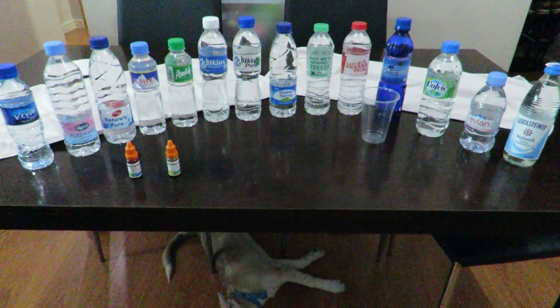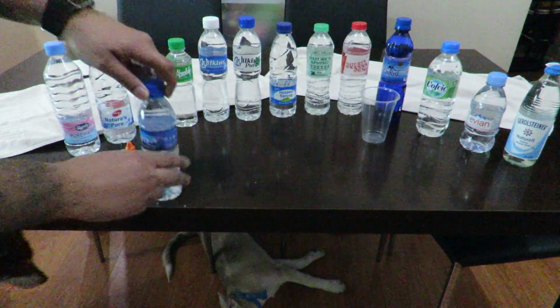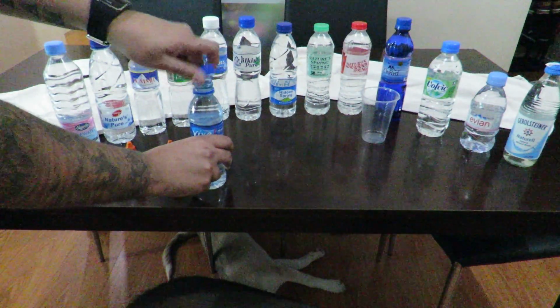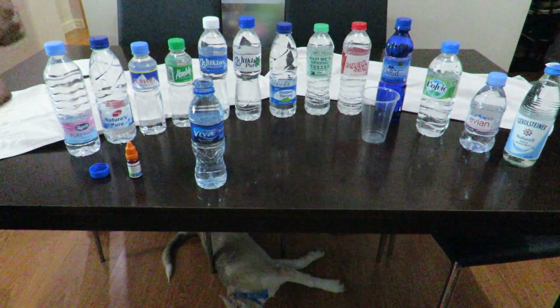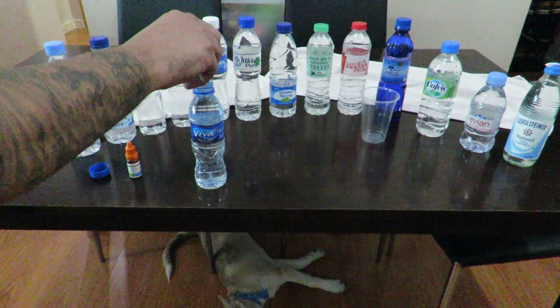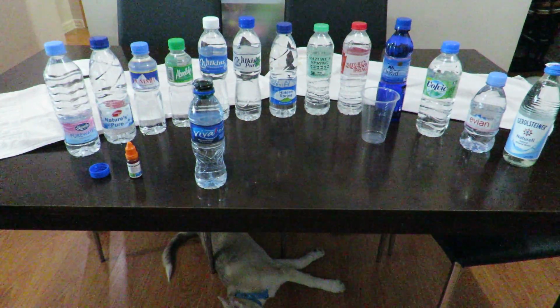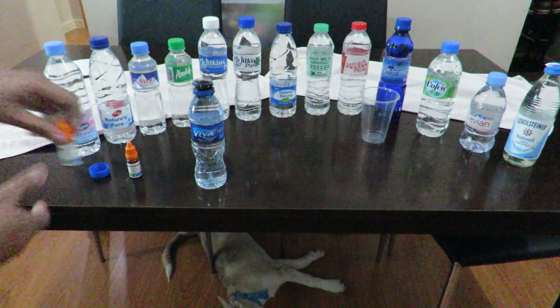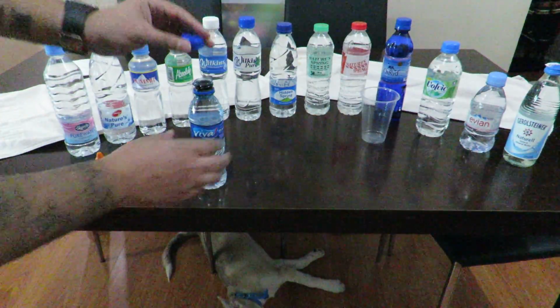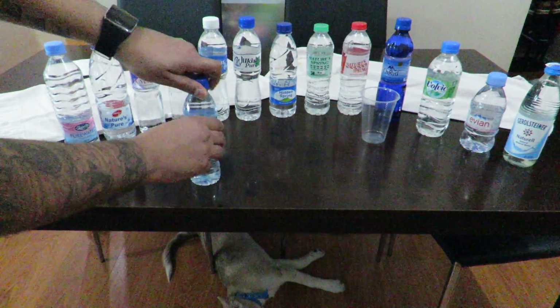So we will start here on the left with Viva. Let's check out and see what Viva water is. All you really do is put about 3 or 4 droplets in, and you see how well the water is. About 4 drops right there, and then we're going to put the top back on, and then all you do is shake it.